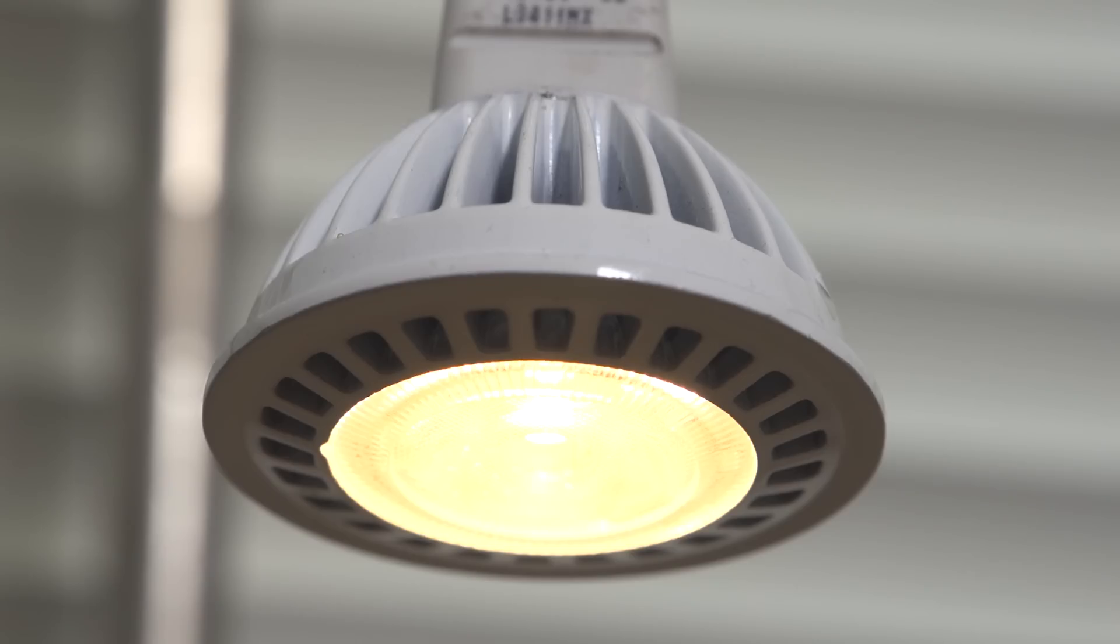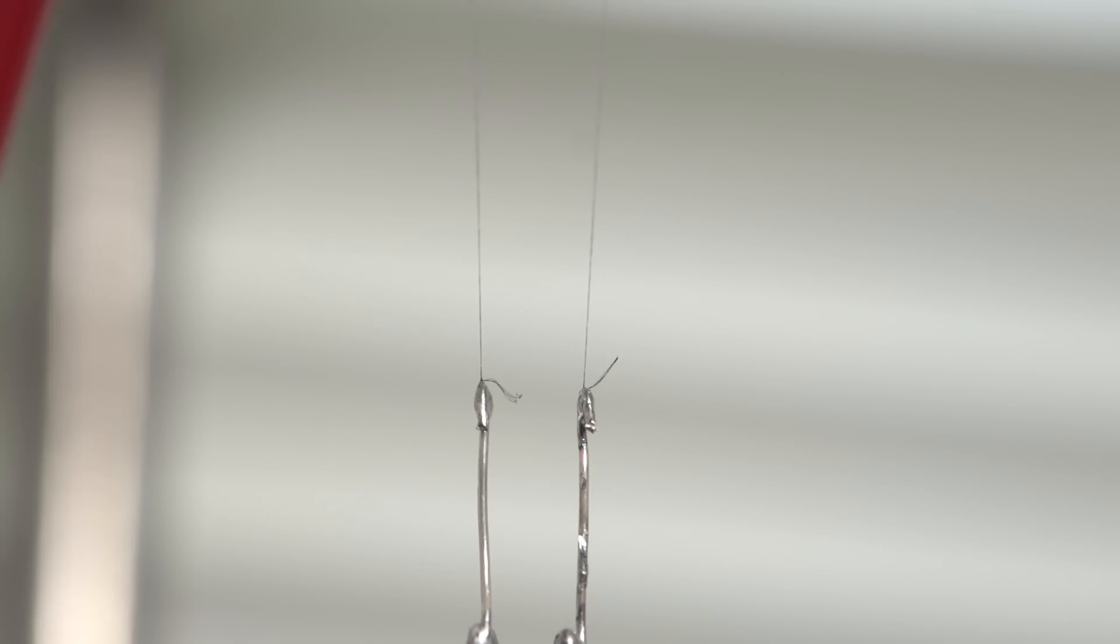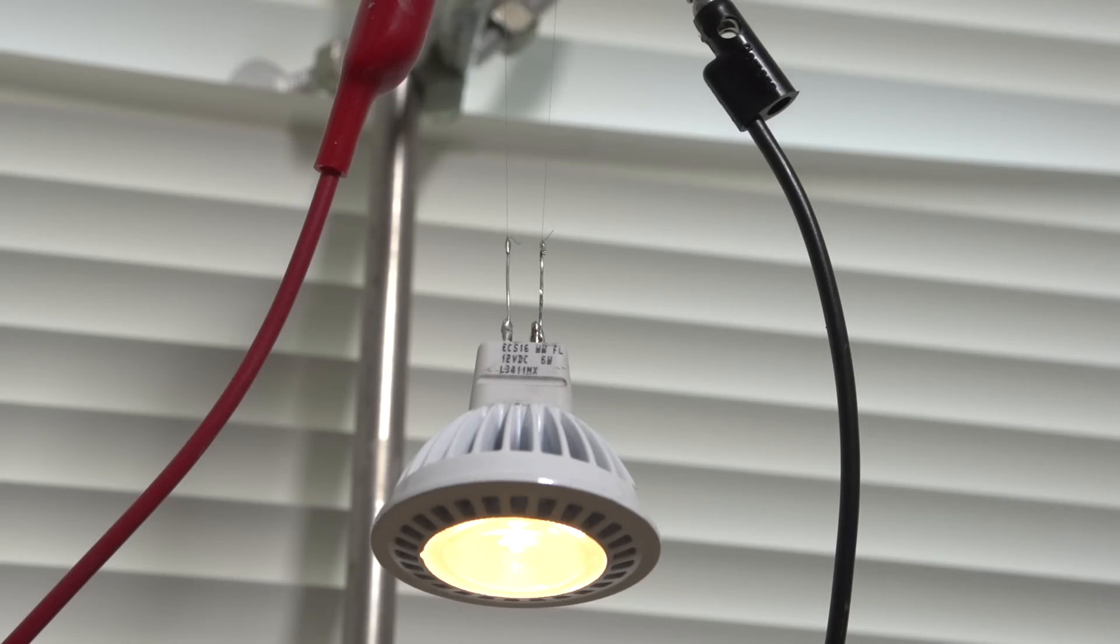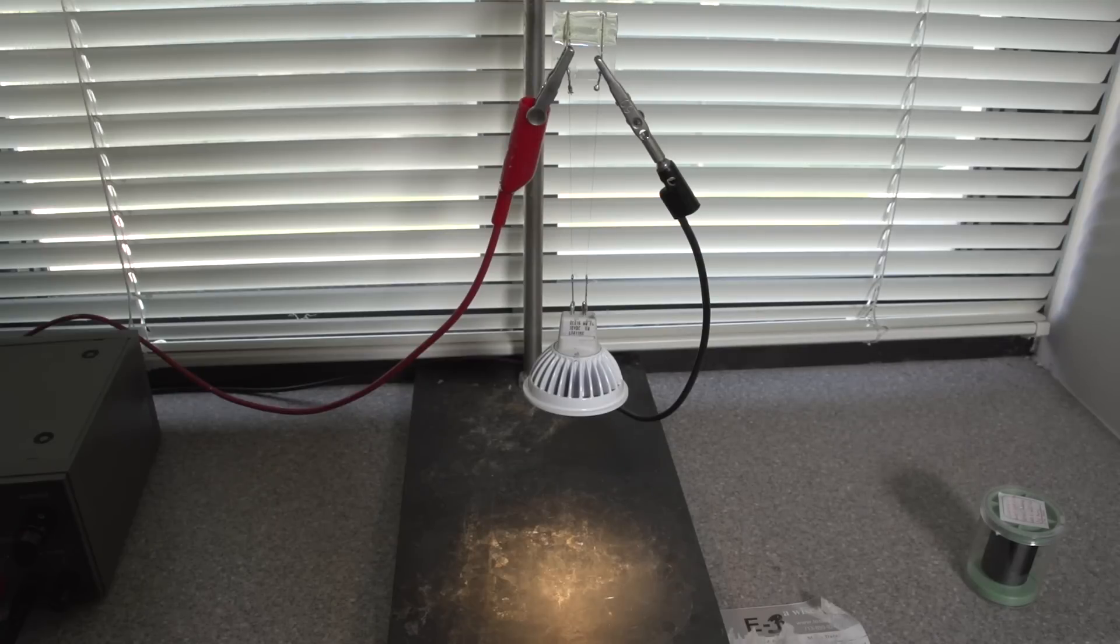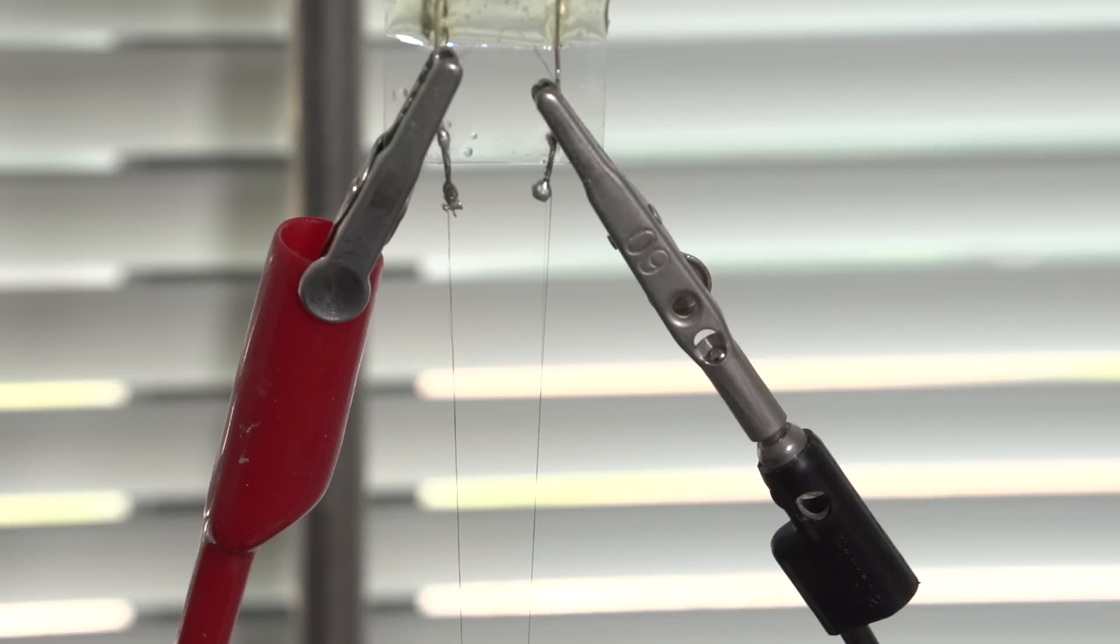What you're looking at here is two bundles of our nanotube fiber that are holding up an LED light bulb that weighs 50 grams. Those fibers are also being used to run the current that's powering the bulb. This demonstrates the multifunctionality of the fibers—they are strong enough to support the weight and have high enough conductivity to provide the current.